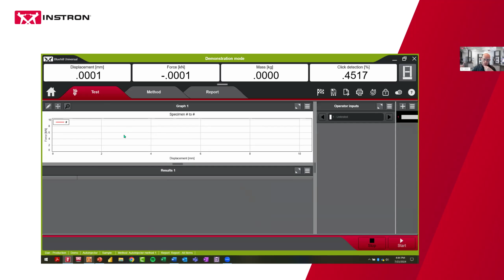And then 24 hours elapses, or at any point in that daily period, if you do choose daily, it's just looking at the date that it's run. So once midnight occurs, it's going to trigger saying it's a new day and we need to run the system suitability.